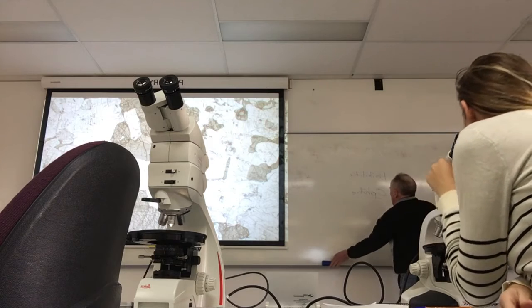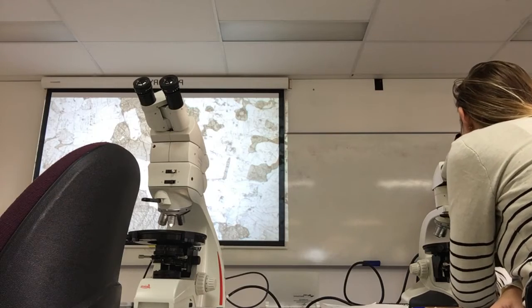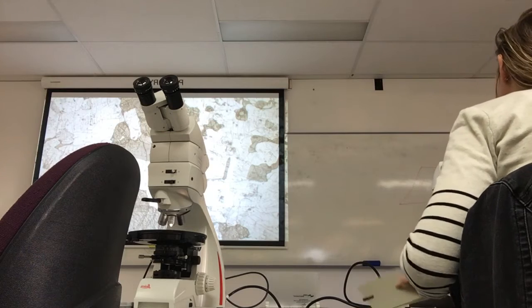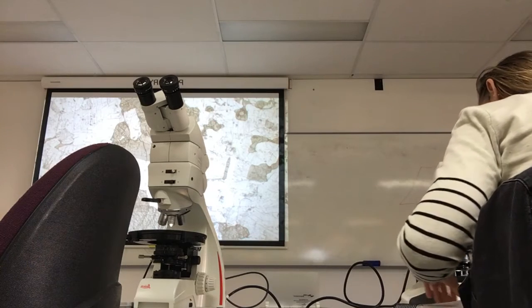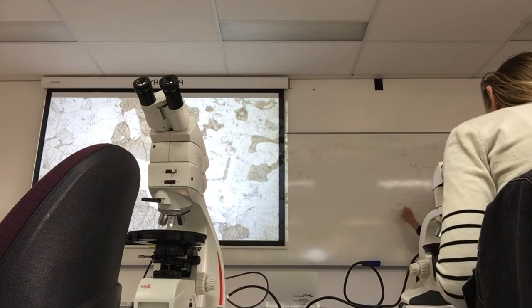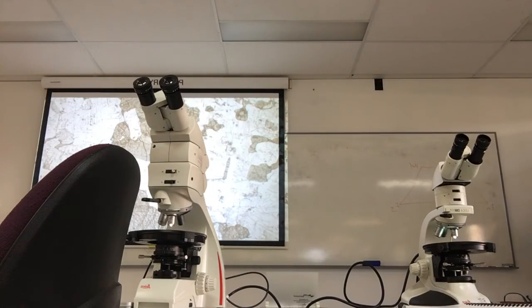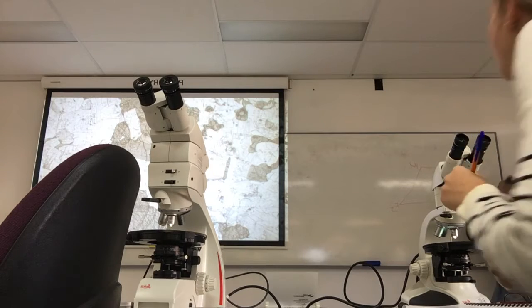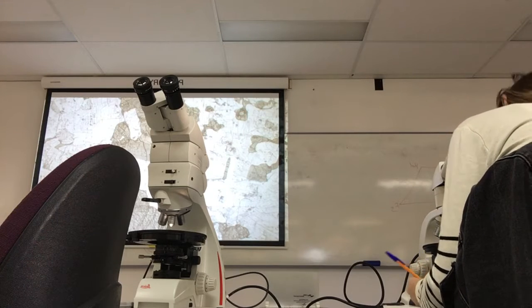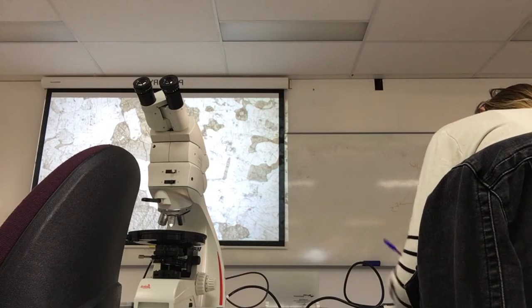And remember when we talked about pyroxenes, you think about what they call the pyroxene quadrilateral. So wollastonite's up the top there, this is diopside, enstatite's here. What slide is this? Oh, this is 1066. Orthopyroxene, so hypersthene and so on are along the bottom here. Augite is up the top.